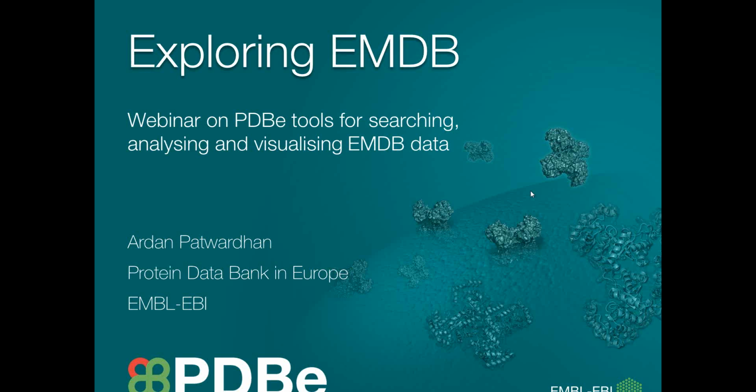You are all probably familiar with the EMDB as the archive for depositing 3D EM reconstructions generated by single particle EM as well as electron tomography. What I'll present today are web-based tools developed by the Protein Data Bank in Europe for searching, analyzing, and visualizing EMDB data. So Protein Data Bank in Europe, or PDBe for short, is a part of the European Bioinformatics Institute.